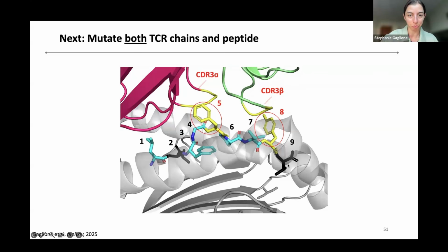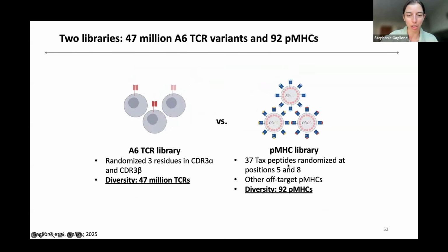And at this scale, you really can't do fluorescence-based sorting. This is something that's just not viable. And so we identified that our pMHC VLPs, which use beta-2M, were compatible with doing MACS. And so what this enables us to do is screen billions of yeast simultaneously against the 92 VLPs, where instead you would have had to do 92 separate selections.